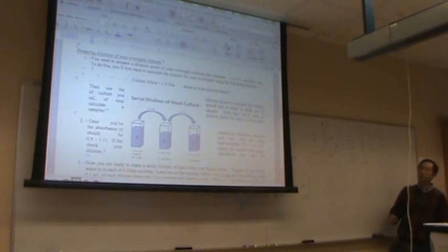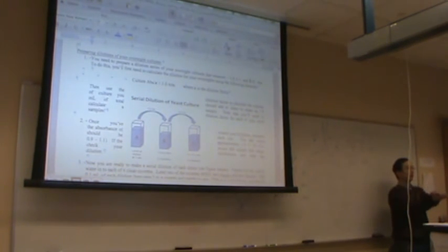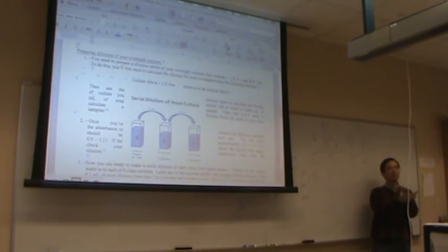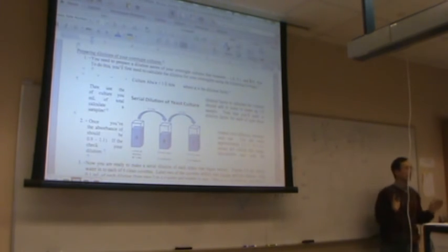And at the end of this, we have the FOA plate, put it horizontally on a desk where it will not be shaken. This has to be because we are putting the liquid on each spot. If you shake it, the liquid is going to spill to the next spot. So the plate has to be absolutely still for at least half an hour for the liquid to be absorbed. You can only move the plate when it's dry. Otherwise, the whole experiment will be ruined.